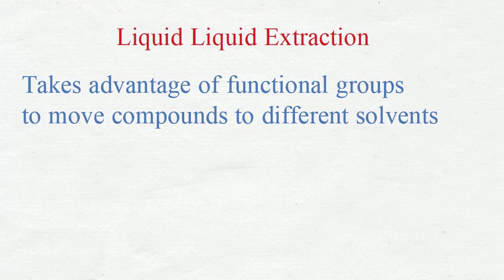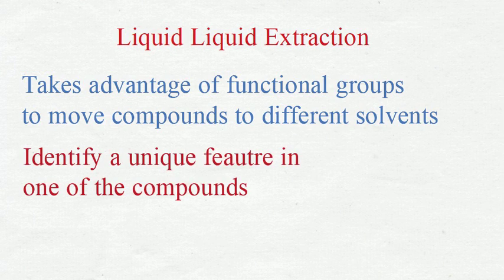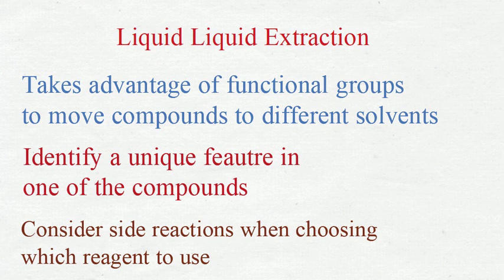Let's review quickly. The basic principle of liquid-liquid extraction is to take advantage of functional groups to move compounds to different solvents. Start by looking for a unique feature that might distinguish one compound from the rest. Consider other side reactions that may also occur when choosing which reagent to use.